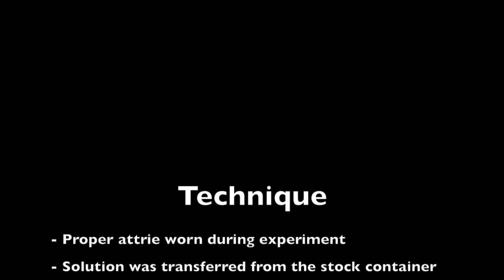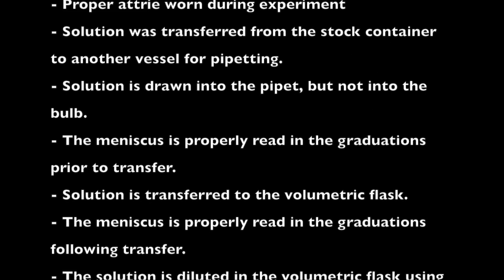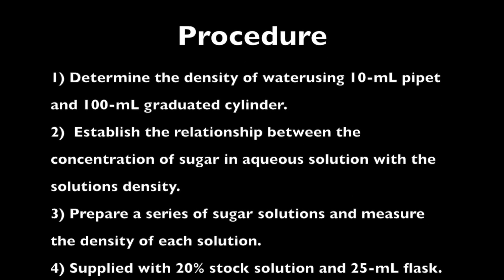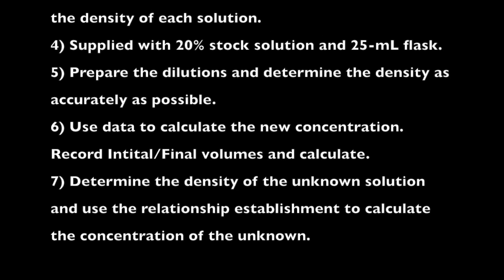Welcome to our Chemistry 116 dilution video. Our techniques that are used throughout this video and experiment, the procedure that was followed to complete the experiment in the lab.